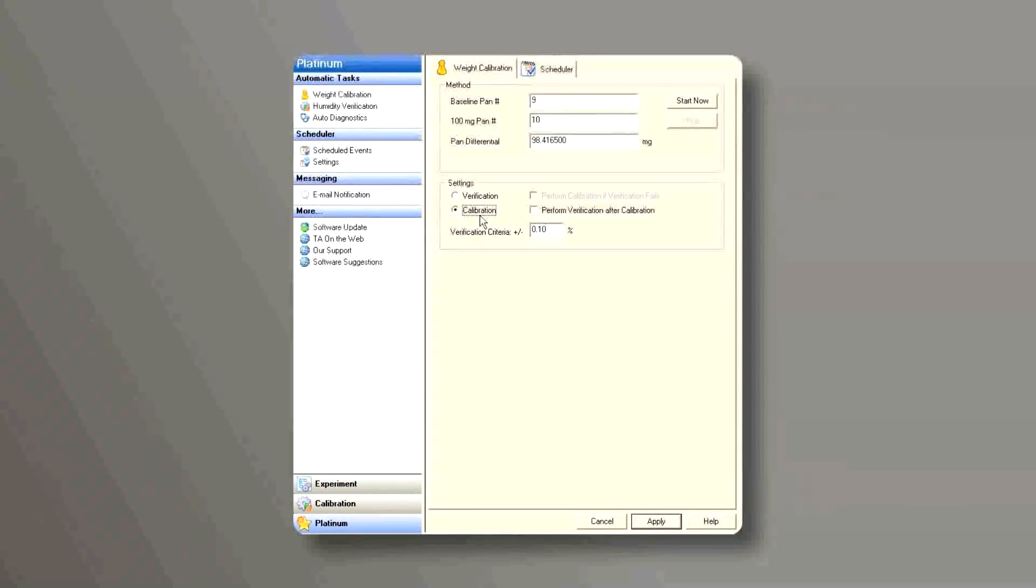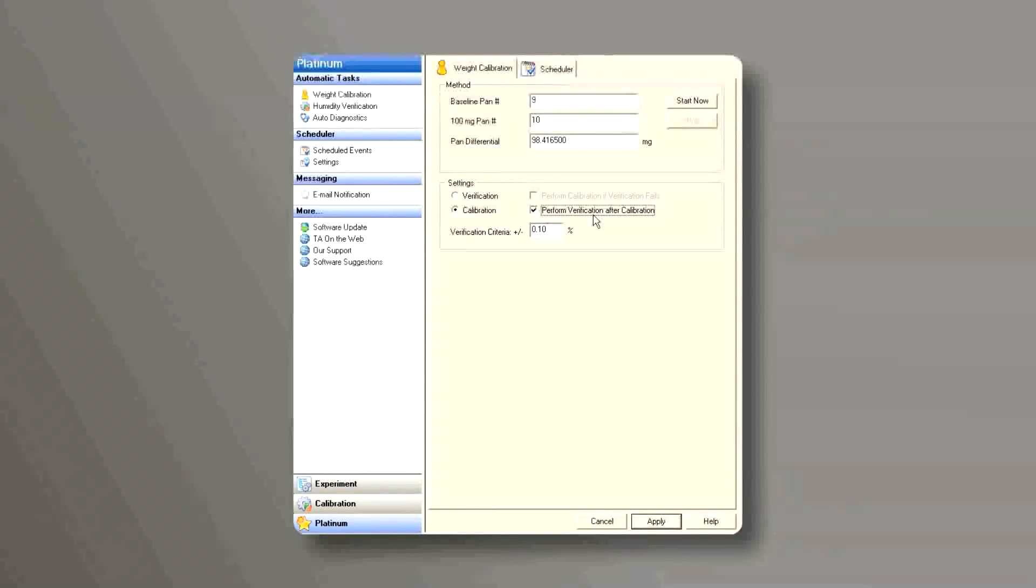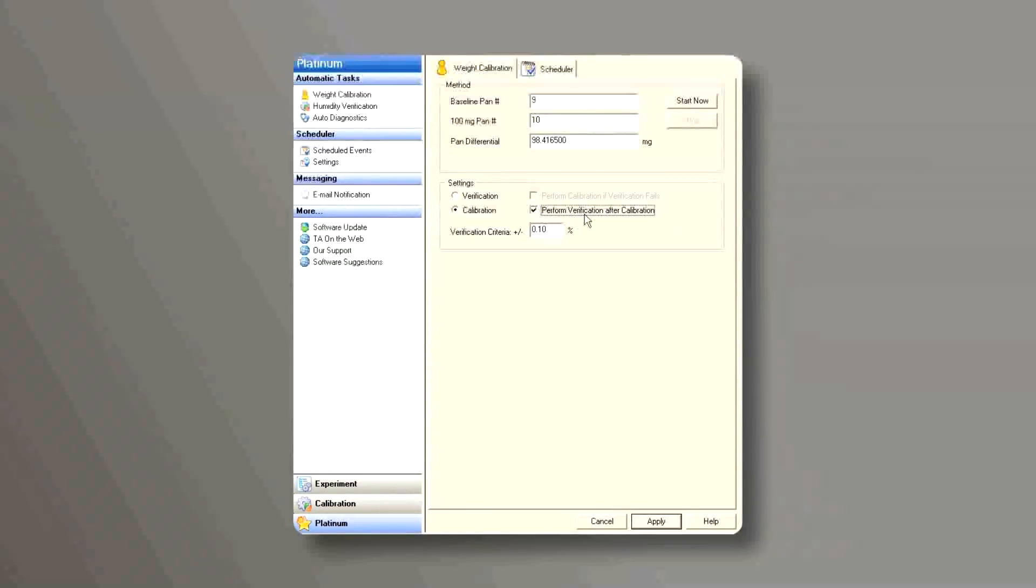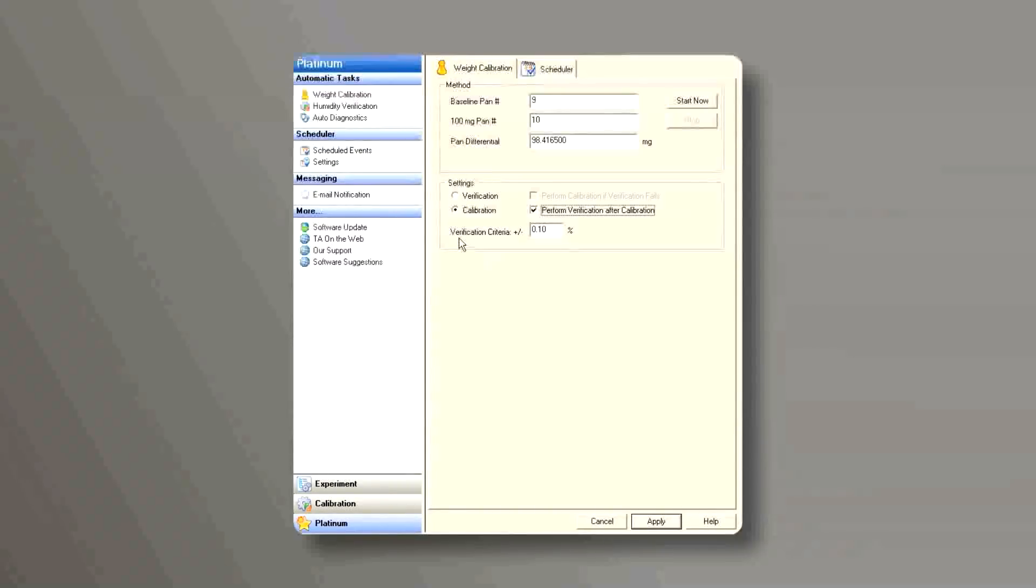Or we can click on calibration and also click on the box perform a verification after calibration. That means after the calibration, the system will automatically do a verification to verify the new calibration.